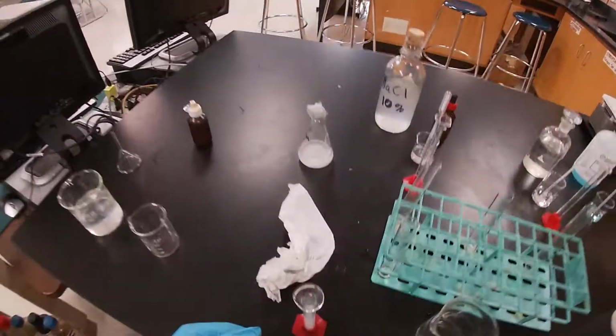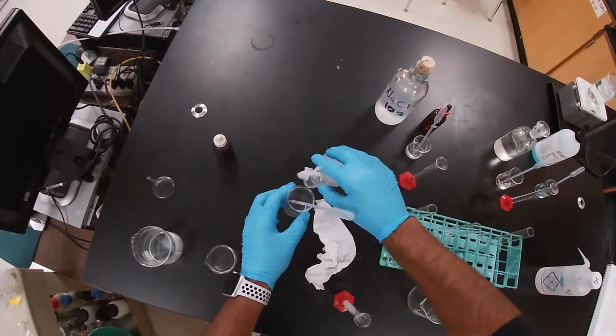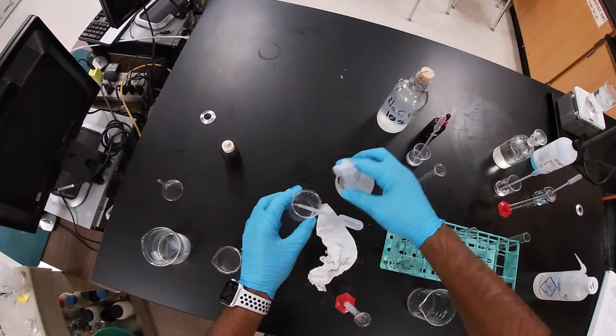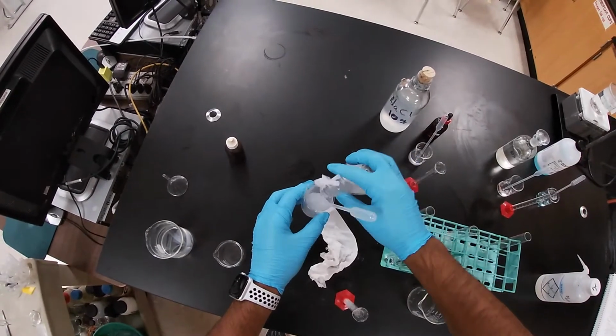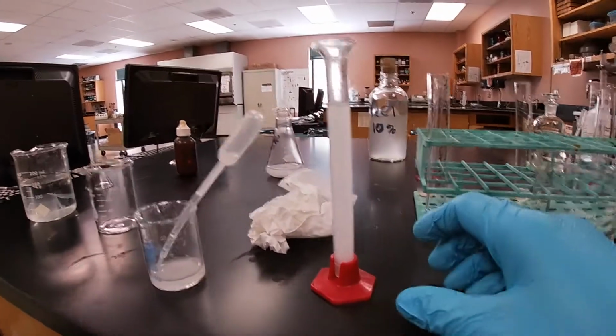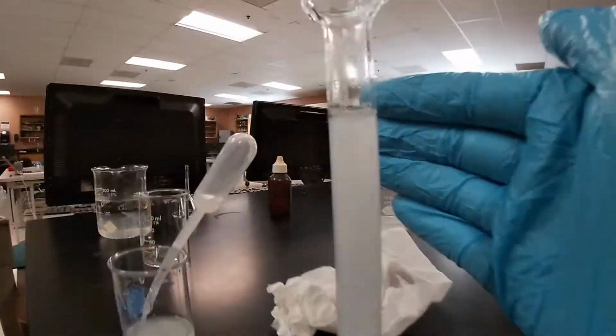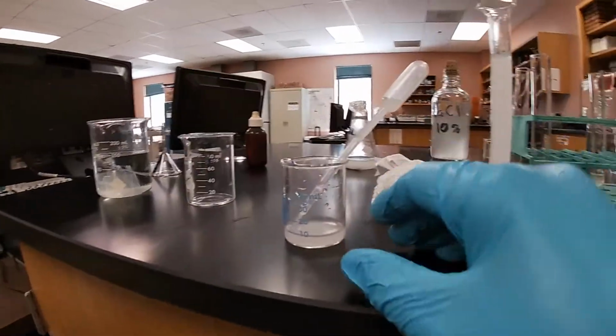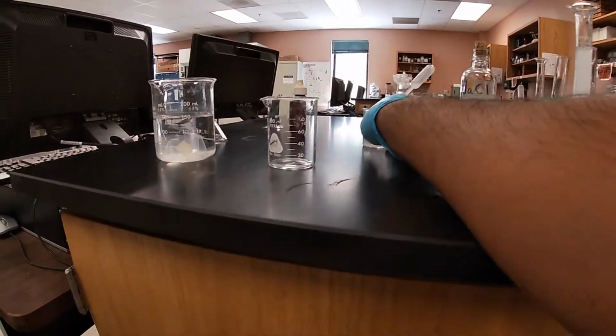Now we'll need some more, so we'll go ahead and get some more out. After measuring our 10 milliliters, hopefully you can see, we're at the 10 milliliters of our starch solution. We're going to replace our starch up there.